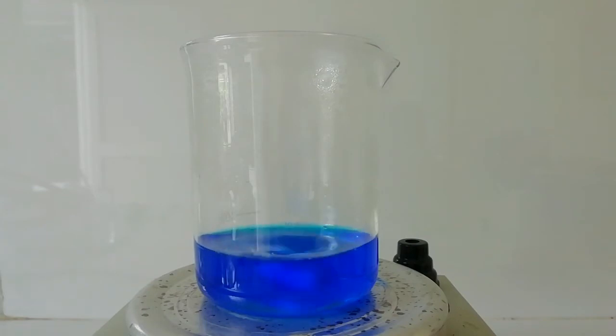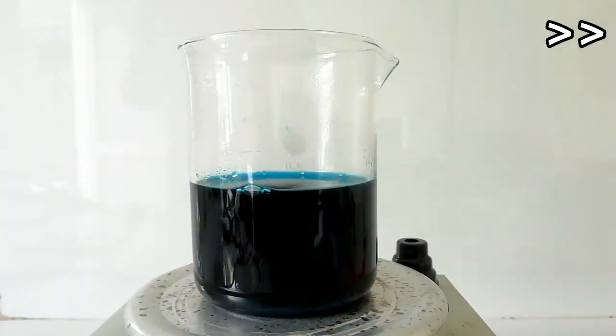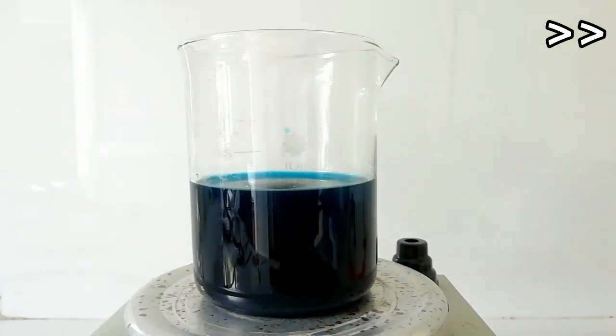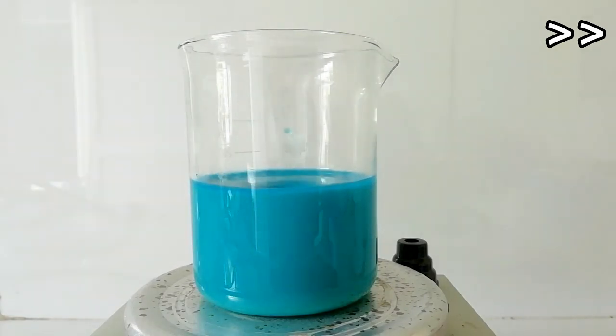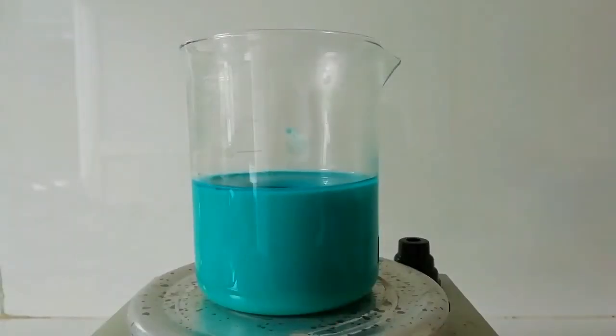Now I'm going to mix these solutions together and keep heating and mixing until we see a precipitate. Now you can clearly see the precipitate of copper citrate. This is more green in color than you see in the video.